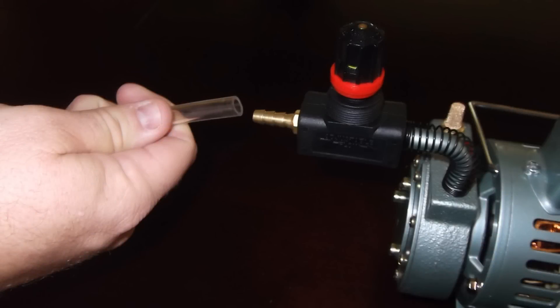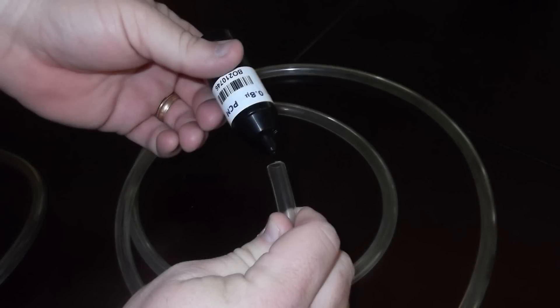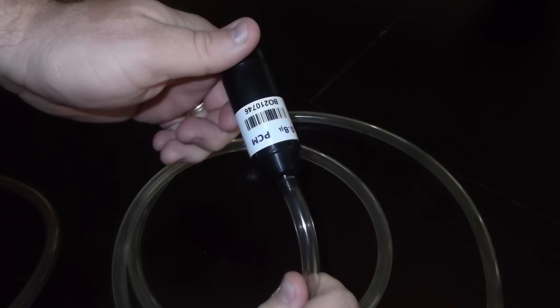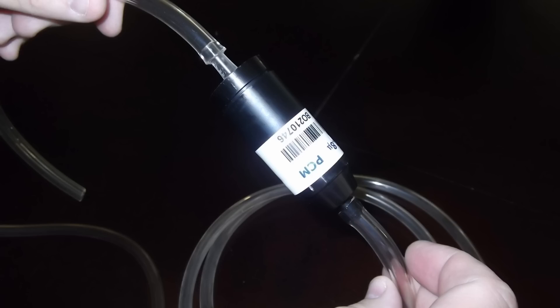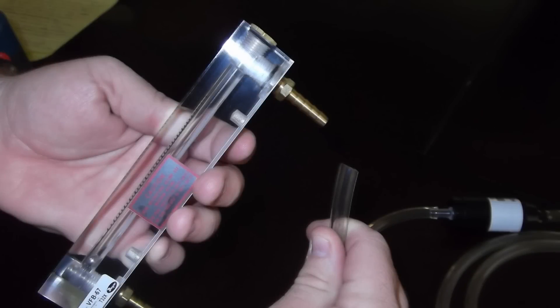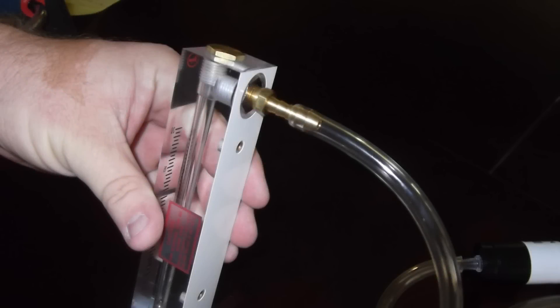Now attach the tubing to the hose barb on the flow valve. Connect the opposite end of the tubing to the sample media. Then connect the inlet side of the sampling media to tubing, with the other end of the tubing connecting to the vacuum side, which is also the top of the rotometer.